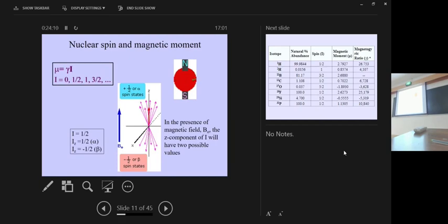So now coming into this first principle, what is this technique? Nuclear magnetic resonance. Every nucleus has a property called the nuclear spin. It's just like I have a hand, you have a hand, everybody has a hand. It is a property of the nucleus, which is called the nuclear spin. It is also called angular momentum. That is in quantum mechanical terms. We will not go into that one.